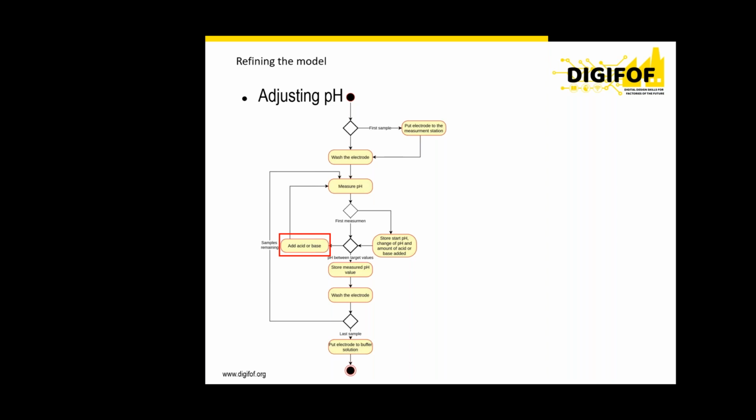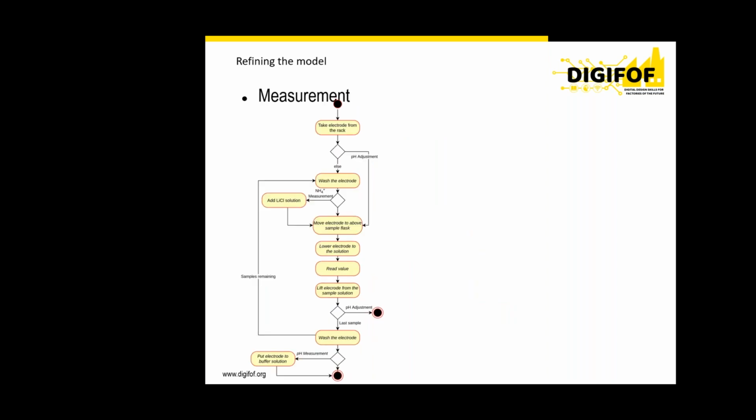So, for example, adding some sample of an acid or a base, and comparing it to the previous pH adjustments.